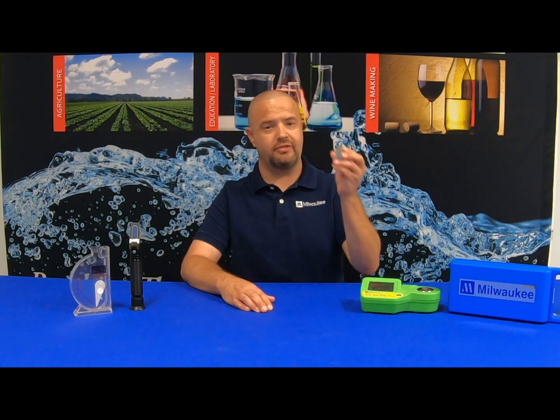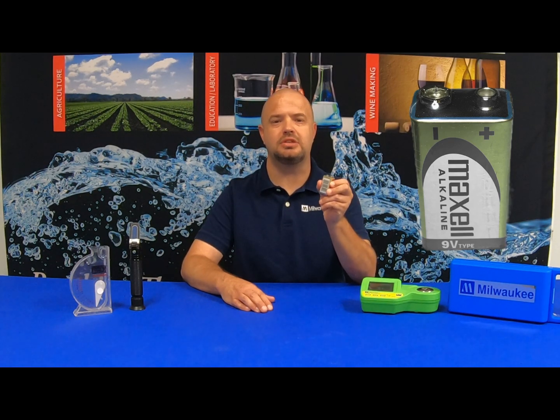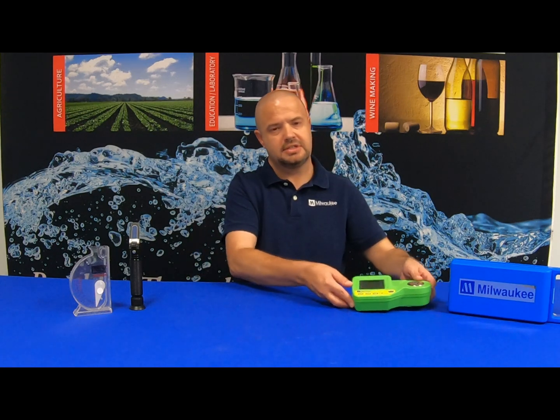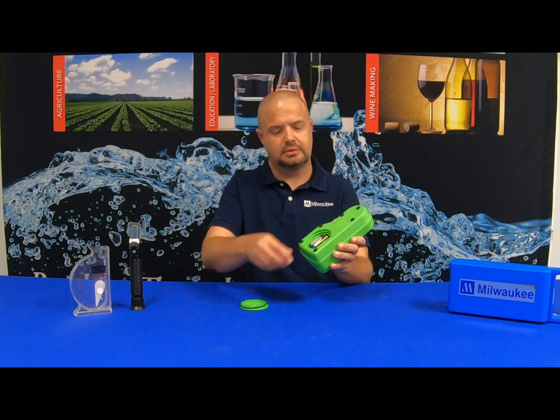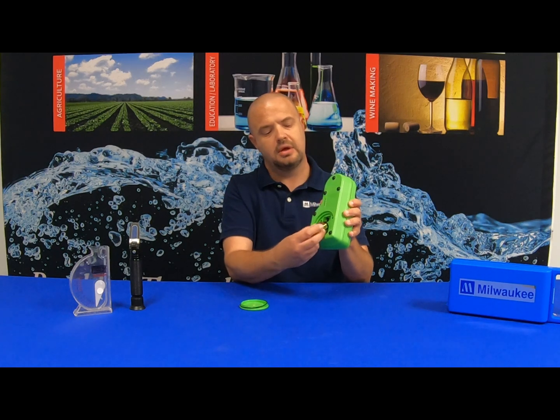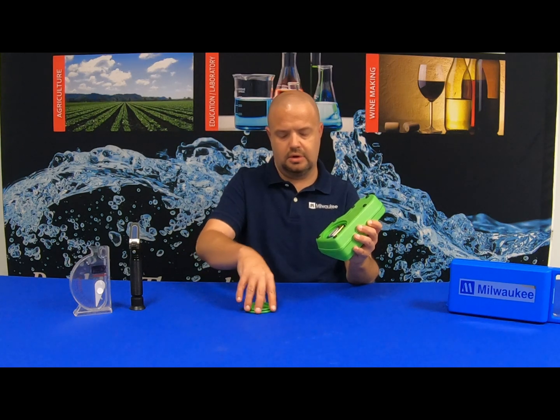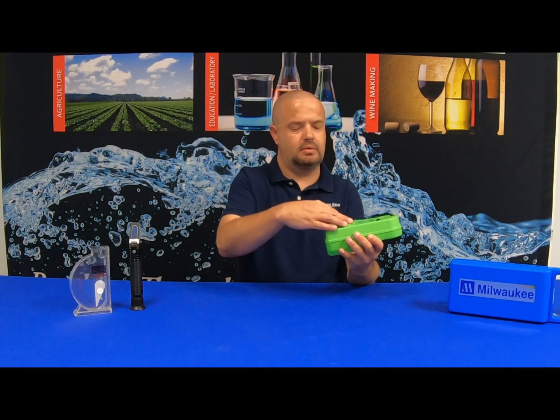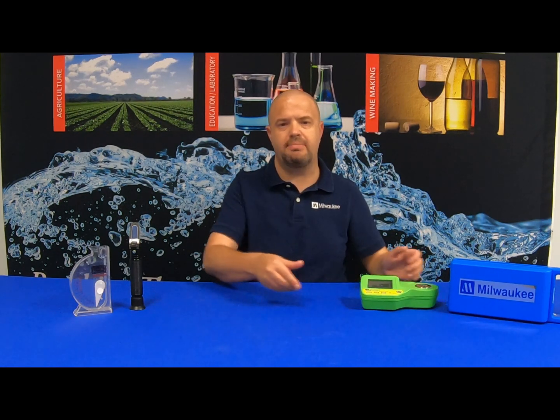The Milwaukee Instruments MA-887 digital seawater refractometer comes supplied with a nine volt battery. Please be sure to remove the plastic wrapping from the battery prior to installation. When you're ready to install, simply flip the unit over and remove the battery lid. Make sure that you line the battery terminals with the connector for proper polarity, put it back in, screw your lid back on, and your unit is now ready to be powered on.